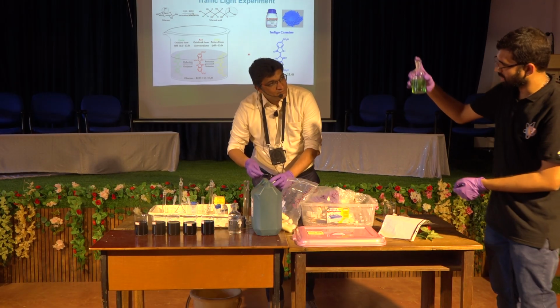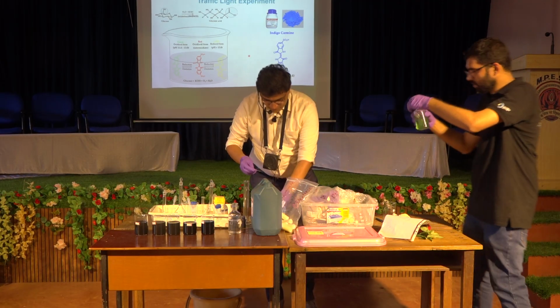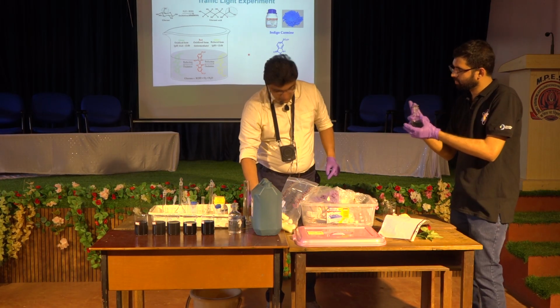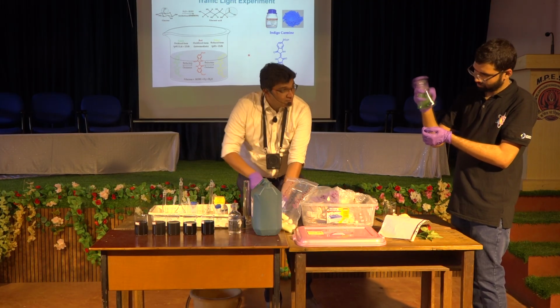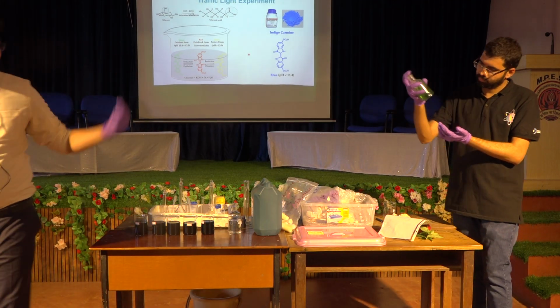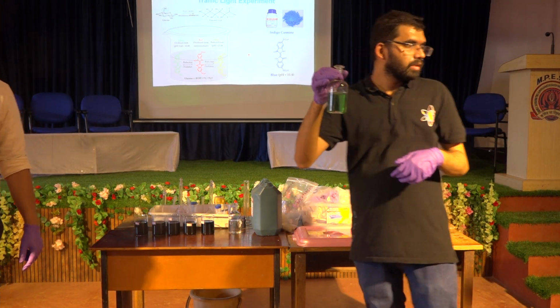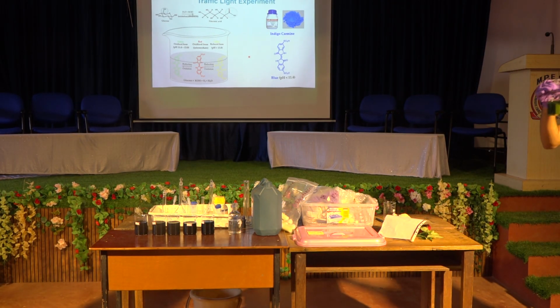You feel that experiment, you know what is going on. That's it. Let it change a little bit. Yeah, I think this will work. Okay, so this is basically an intense blue-green that you can see. Now you can leave it. Can you come this way? So now observe what happens.